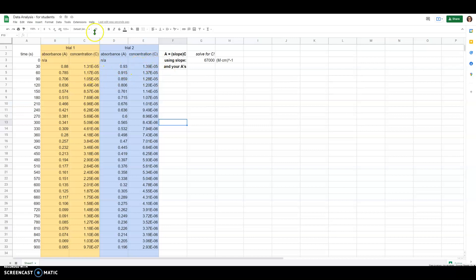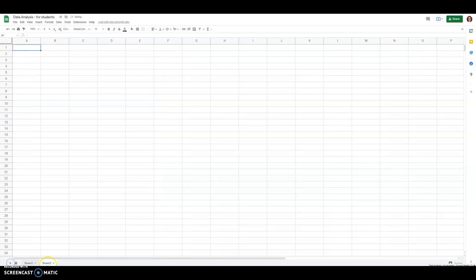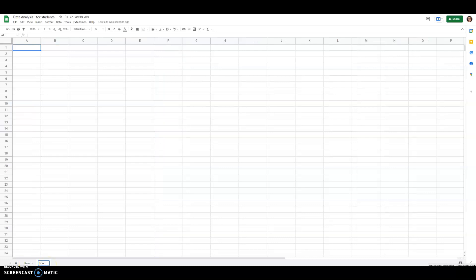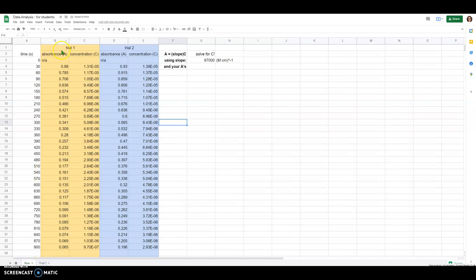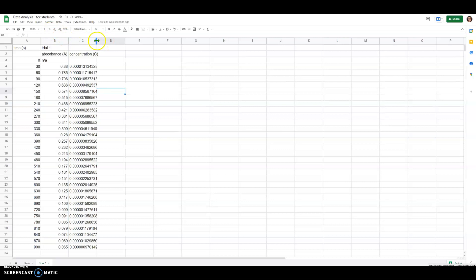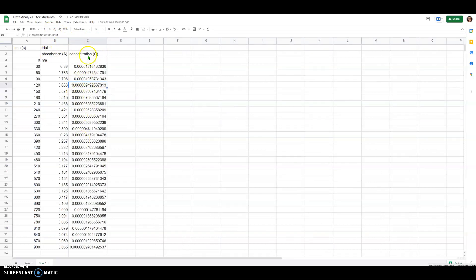Now that we have all the concentrations calculated, it's time to start working on the graphs. I'm going to make a new sheet — I'll label this first sheet 'raw data' and on the next sheet I'll name it 'trial one.' For the trial one data, I'll copy out the time, absorbance, and concentration values, and use Paste Special to paste the values only. I lost my number formatting, but that's okay — it doesn't need to look pretty.